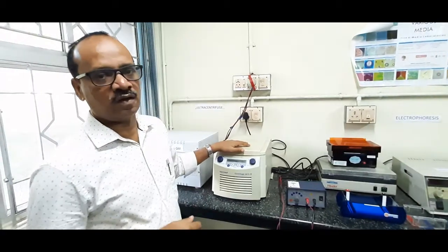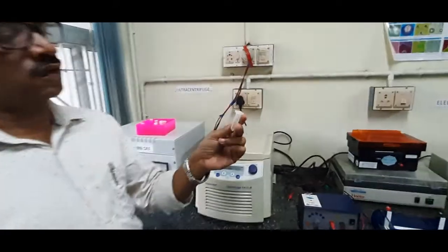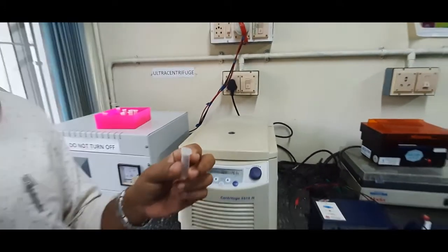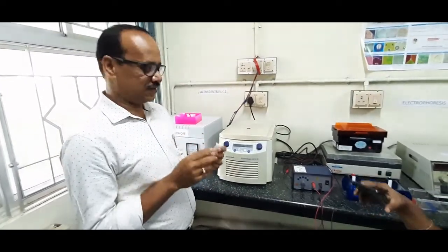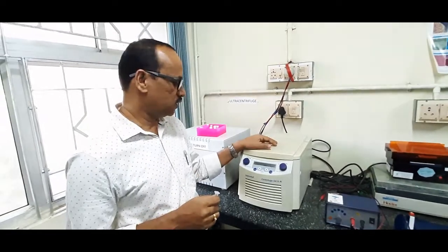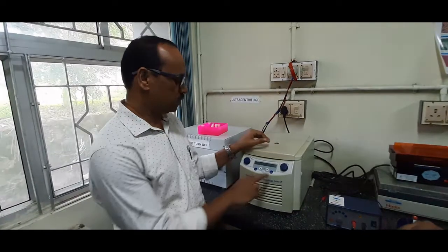This is a microcentrifuge. We will be using microcentrifuge tubes. These are the microcentrifuge tubes — they come in 2 ml volume, 3 ml volume, 1.5 ml volume, etc. Whenever we go for genomic DNA isolation, we will be taking the culture in these microcentrifuge tubes and then centrifuging the tube content. By that way, you can separate the microbial cells from the culture media.